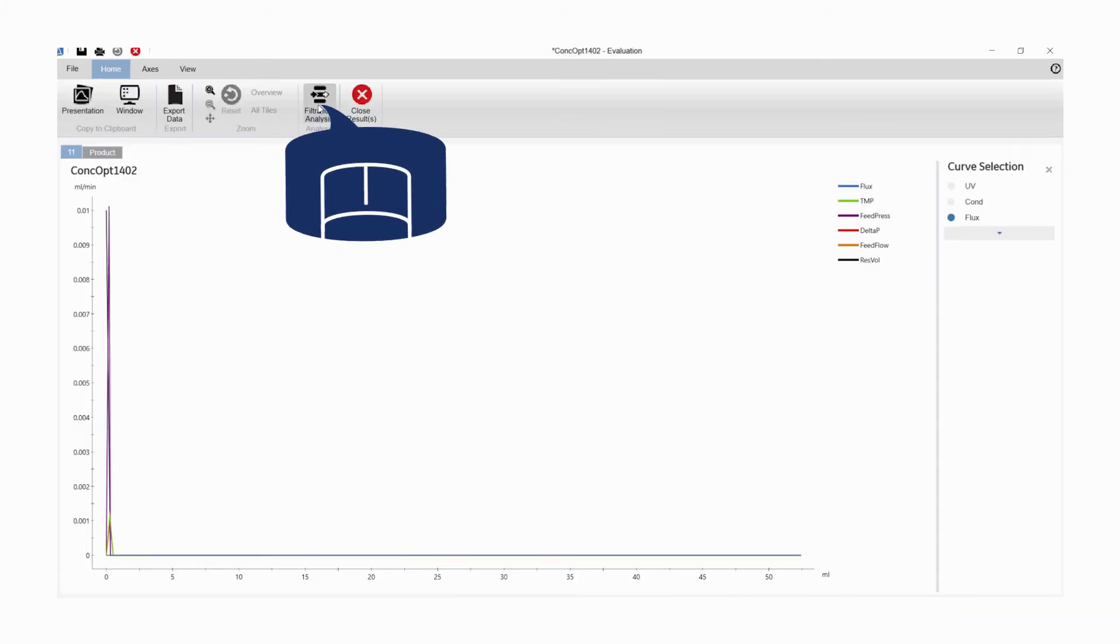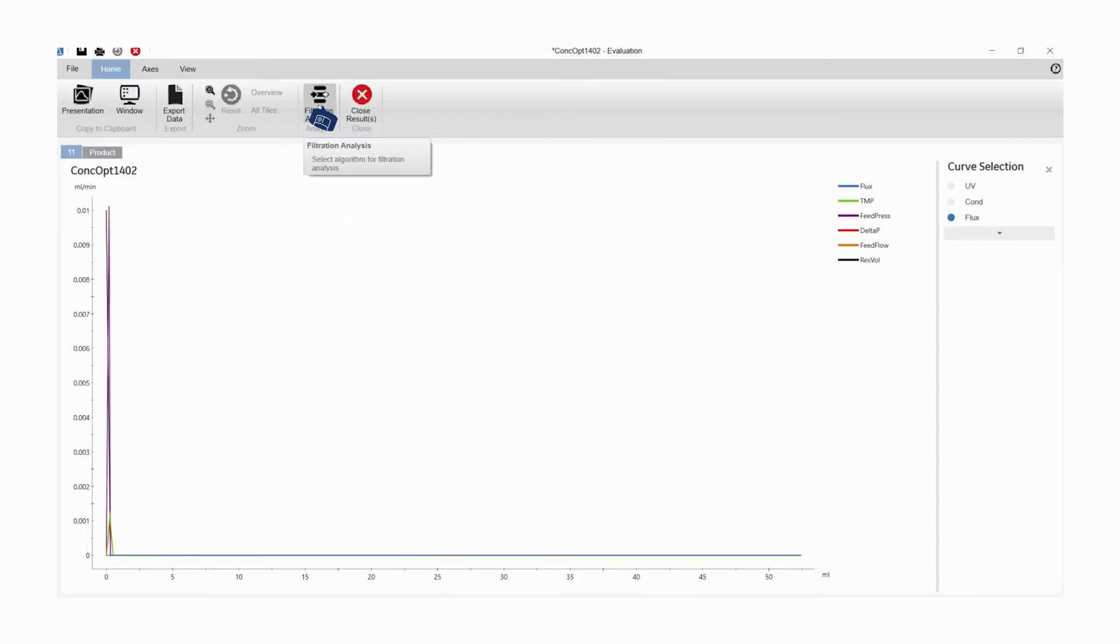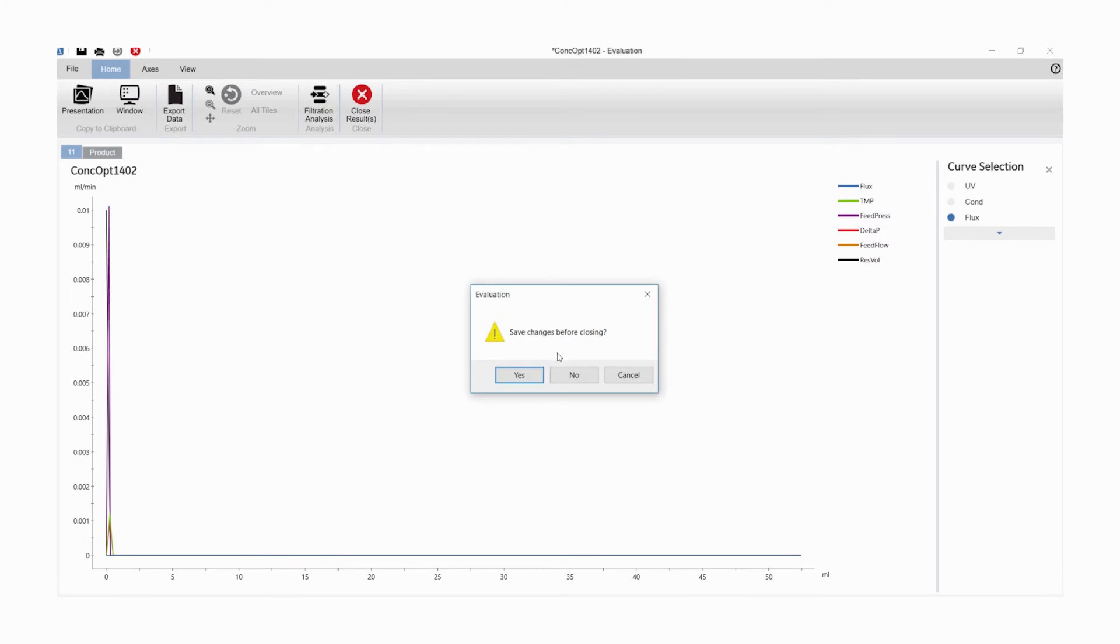Click Filtration Analysis to start the analysis. In the pop-up window, you can save changes and select and proceed with analysis.